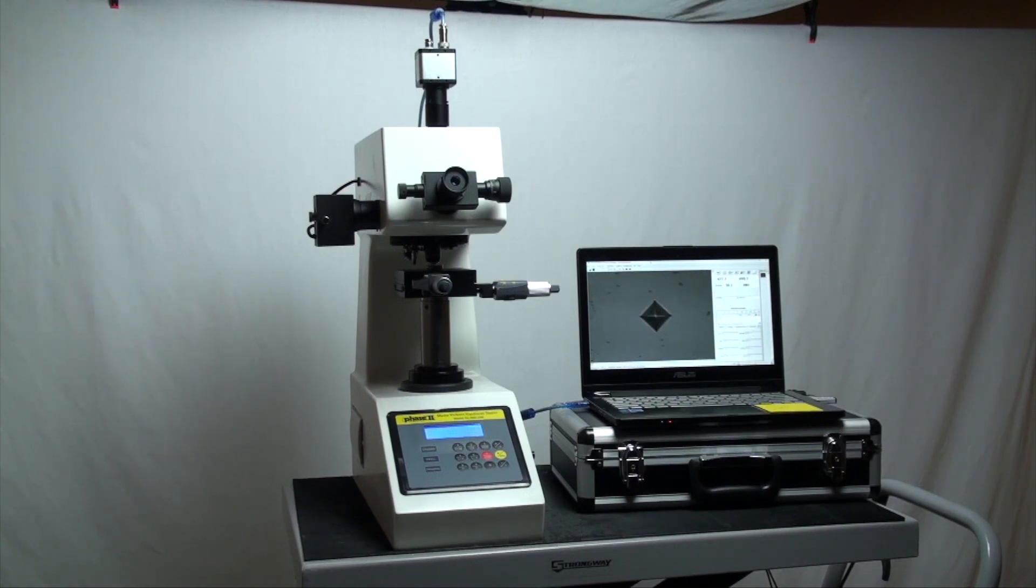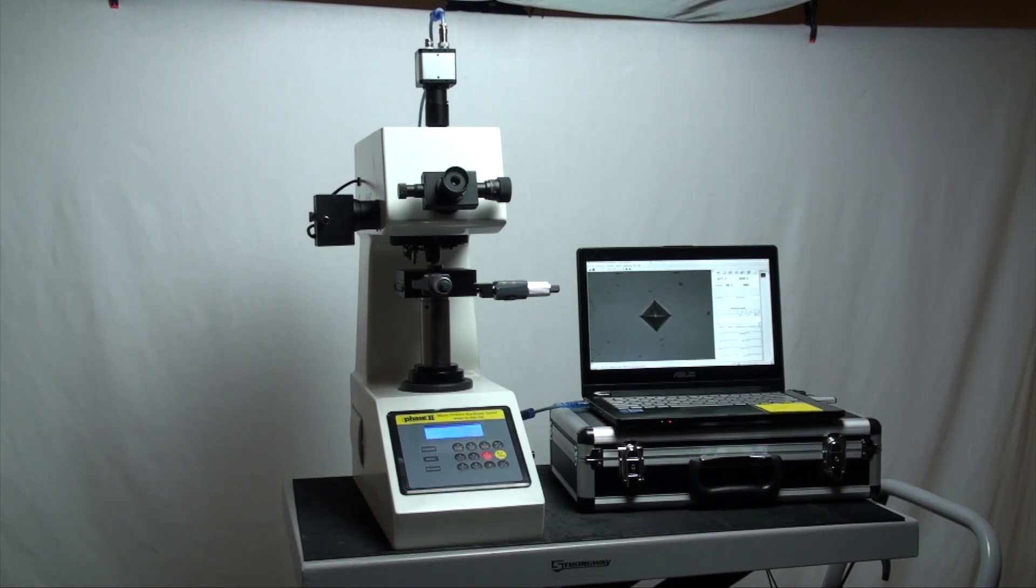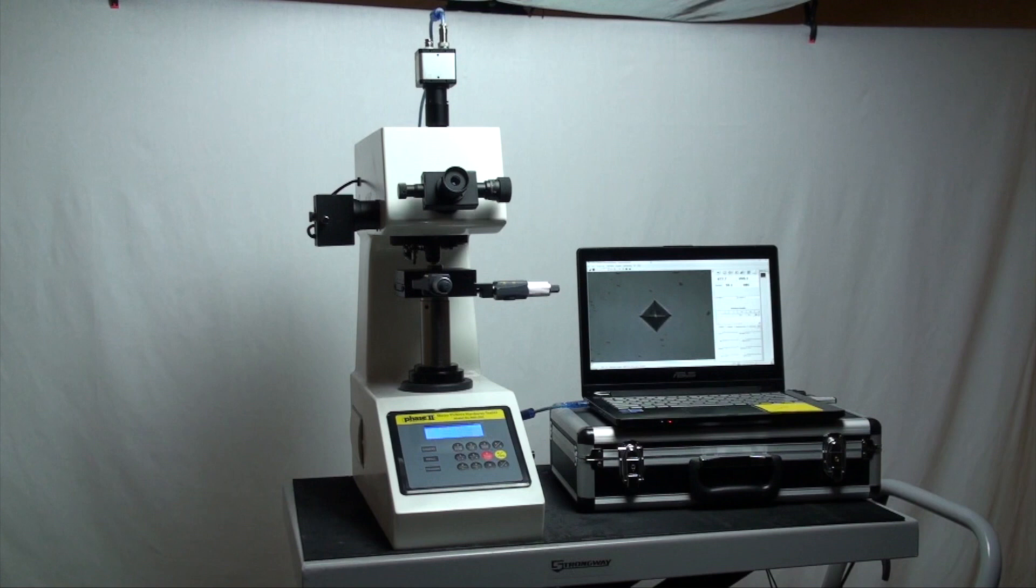These hardness testers are designed to test primarily metals using the Vickers hardness method. They are state-of-the-art precise testing systems suitable for hardness analysis of metallic specimens in metallography laboratories or production environments.